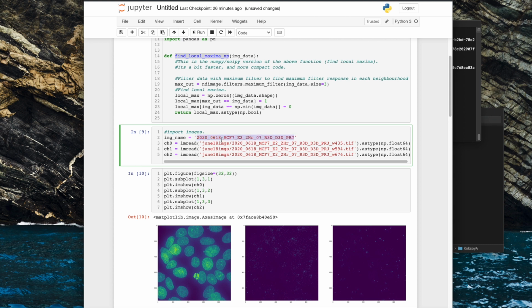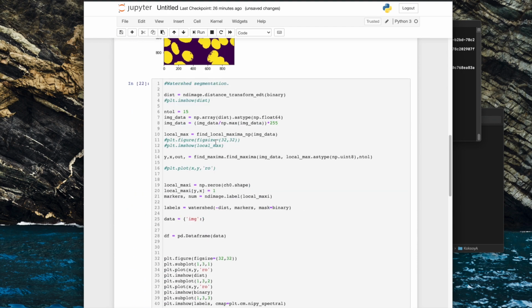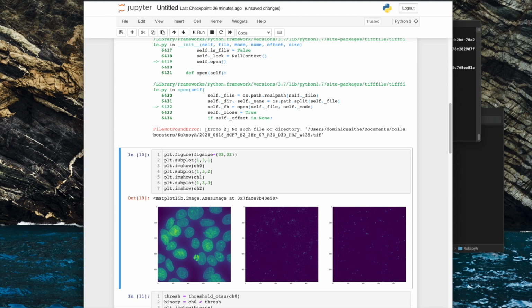And the reason I'm taking this, splitting this out now, is so that you could write a script which cycles through the image names, and everything else is set. So the channels are discrete from the bulk of the image name, and this is sort of the root which is consistent. So we'll take that, we'll run that, sorry.